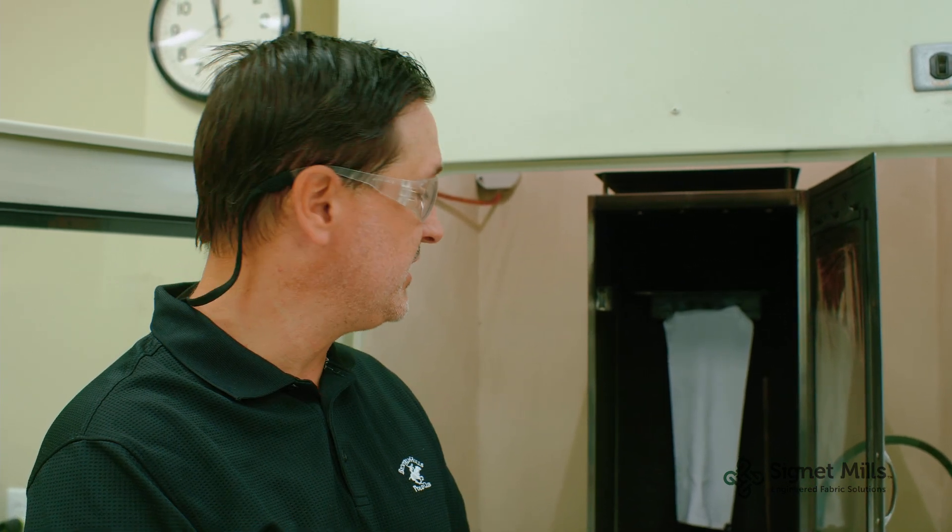Another common test we do at Signet Mills is NFPA 701. This FR test is designed specifically for indoor home furnishings, drapery fabrics, and things of that nature.